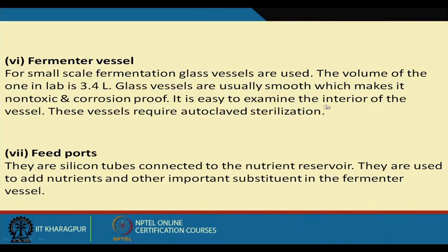We discussed before how the composition of the alloy steel, stainless steel, improves the acid resistance or corrosion resistance. That is why stainless steel is used in the fermentation industry.